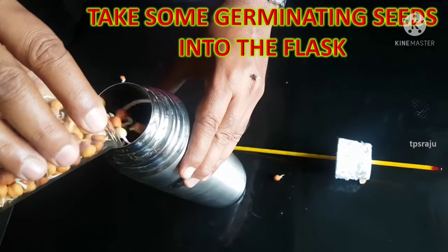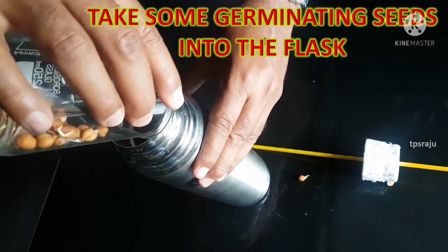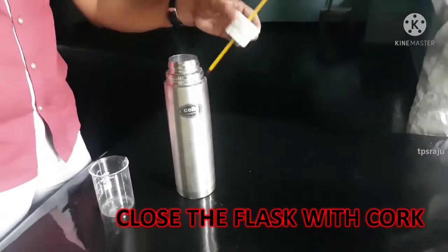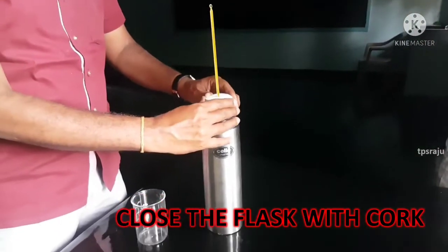Take some germinating seeds into the flask. Now close the flask tightly with cork.